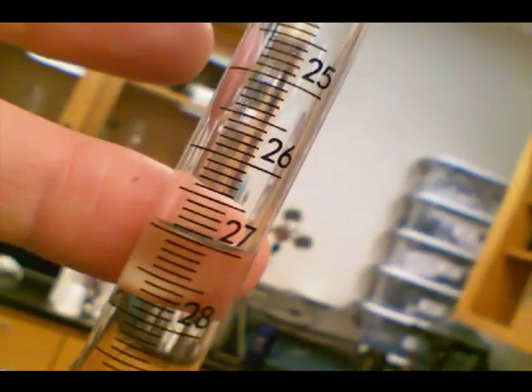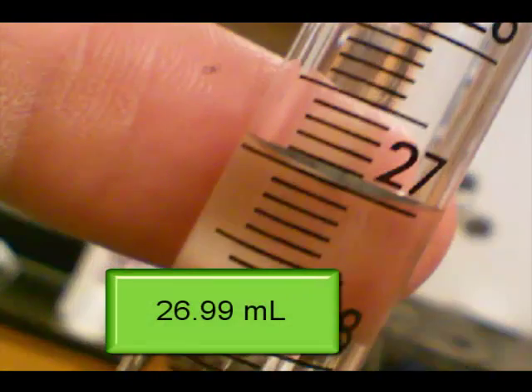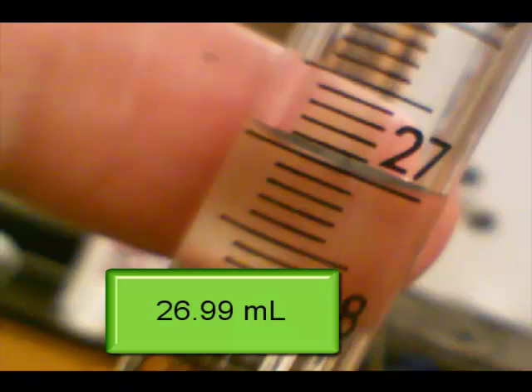Now I need to measure what's the final volume reading so I can tell how much got delivered out of there. I'm reading at the bottom of the meniscus, I'm measuring to the nearest hundredth, and I'm going to call that 26.99. It's almost touching the 27 line, but not quite.